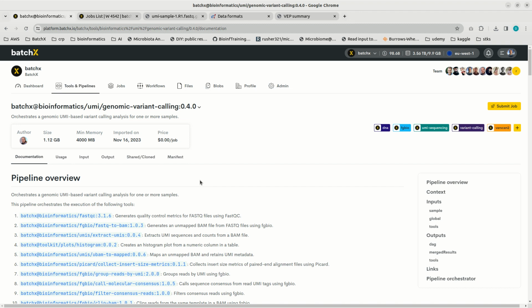This is especially useful when you want to achieve greater sensitivity on variant calling, like being able to call variants that are less than 1% represented in the sample, which is the case for liquid biopsy samples, in which you are expecting to find circulating cancer DNA in the blood, which is very low represented.